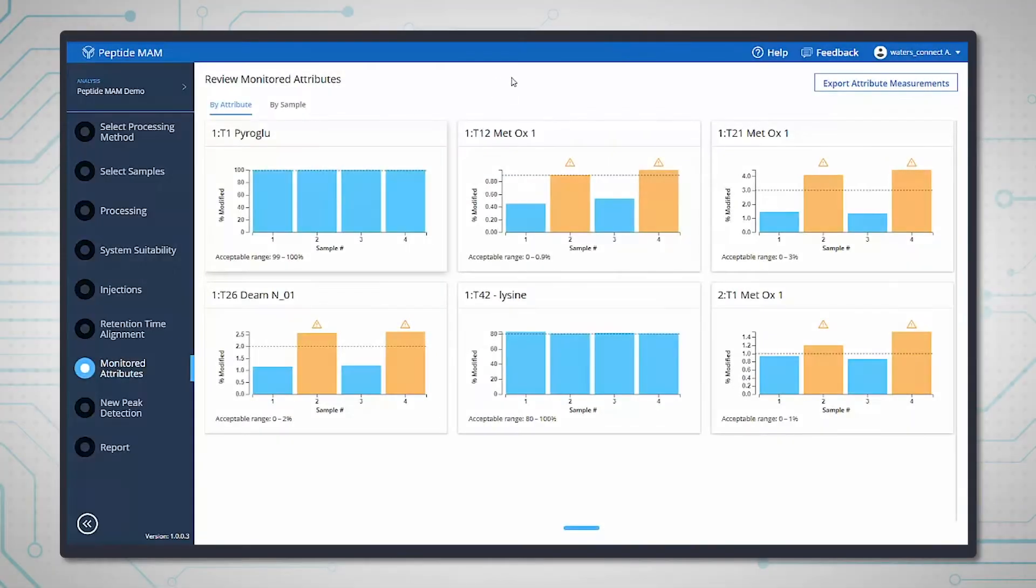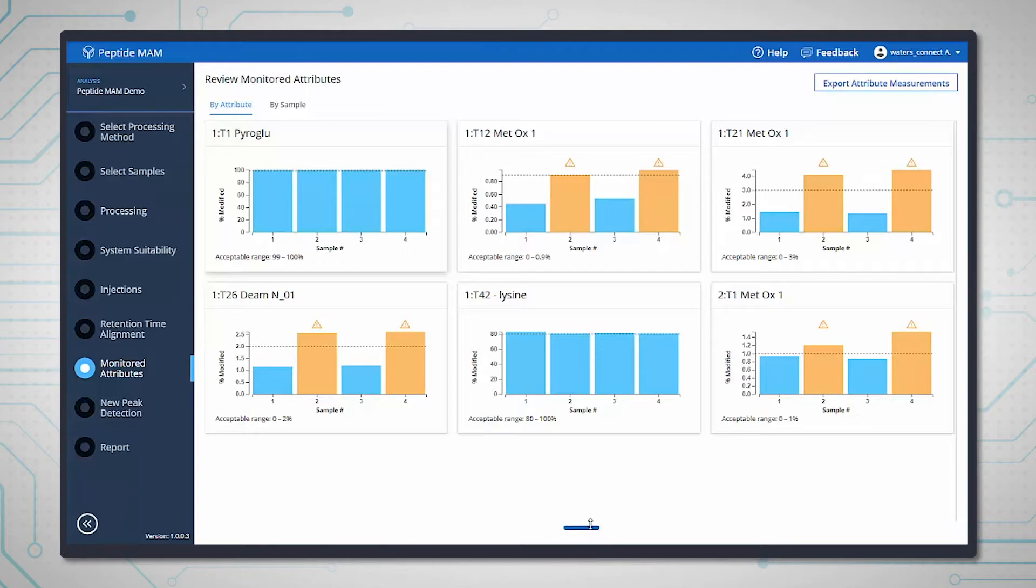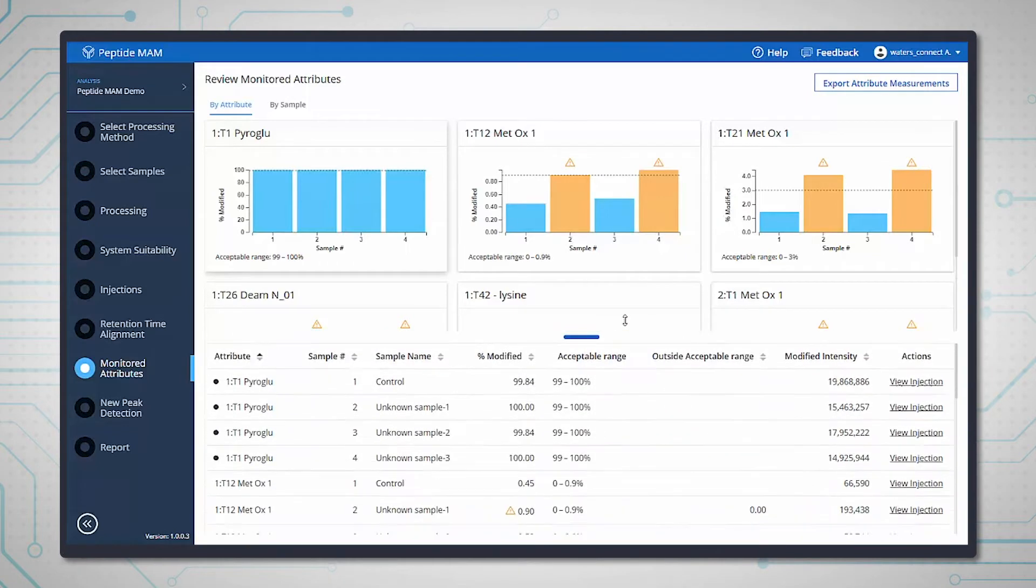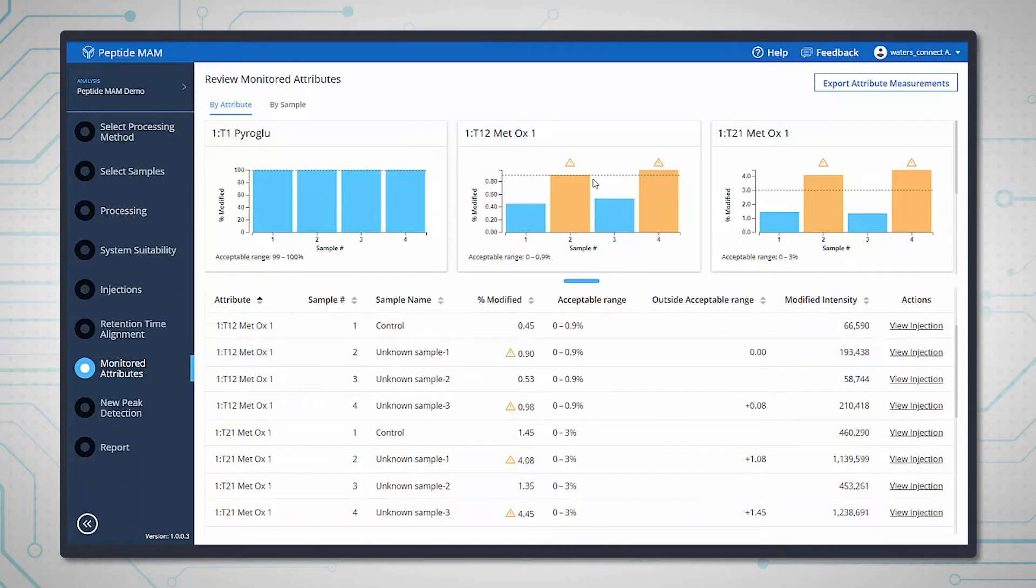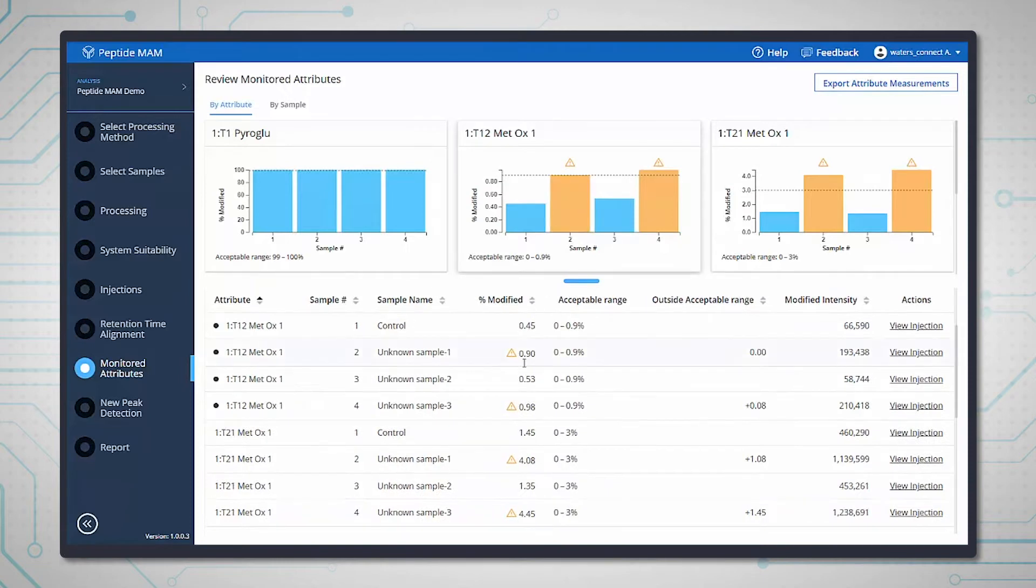Here you can see how the results for each monitored attribute are displayed in clear visual plots. These plots or histograms immediately highlight if an attribute has been measured outside of the specified tolerance in any sample across the batch.